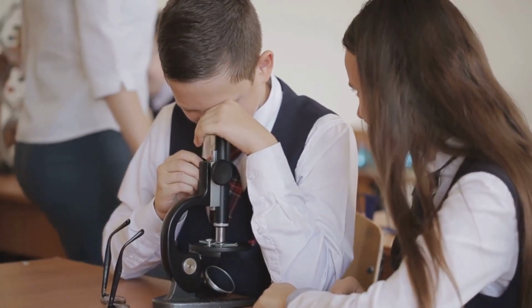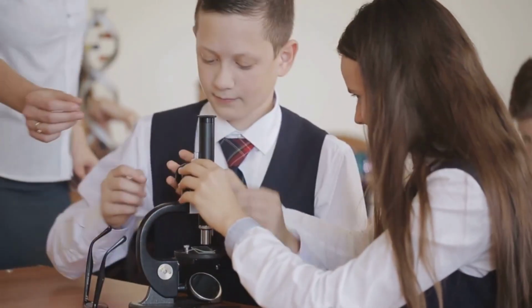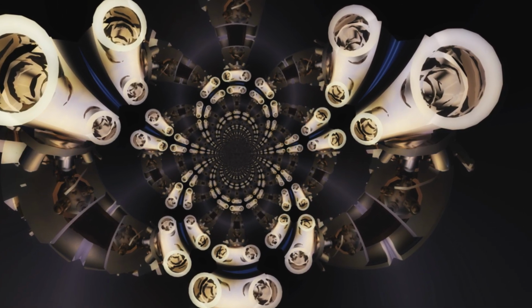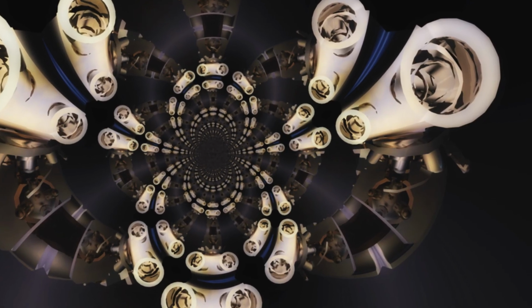That shorter wavelength is the secret to the electron microscope's power. It can see things in much greater detail. Because it uses electrons, an electron microscope is built very differently. It doesn't use glass lenses. Instead, it uses powerful electromagnets as lenses.